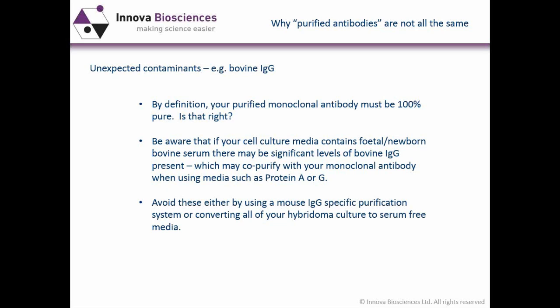You can avoid this by using a mouse IgG specific purification system based on affinity chromatography, or of course by converting all of your hybridoma cultures to serum-free media.